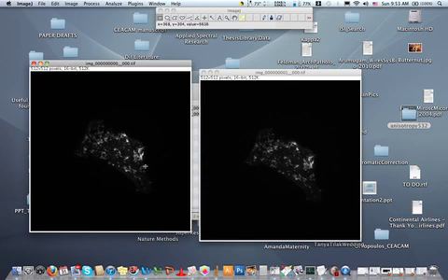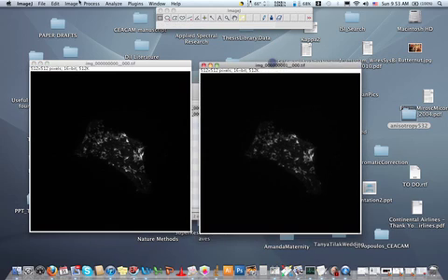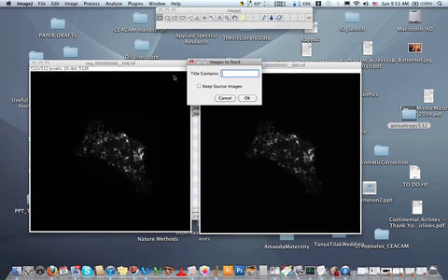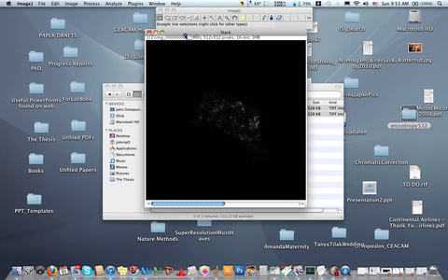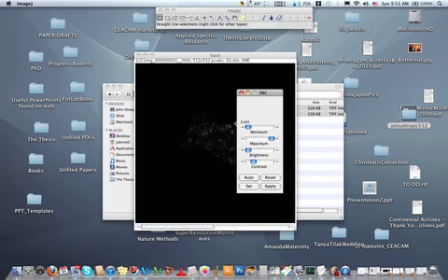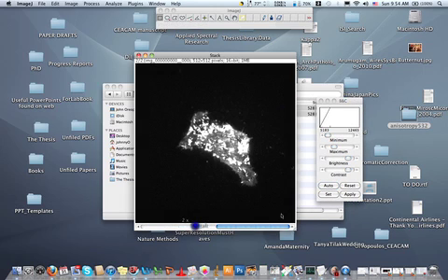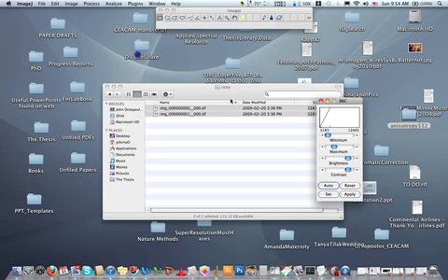This is the image collected when the polarization on the input and the output is parallel, and this is the image when the polarization input and the output are perpendicular. Now I'm just going to put those into a stack so you can actually see that there is an intensity difference here. I'm just going to auto contrast this. This is way blown up, more than normal, but you get the point. And it's actually put the images in the wrong order, but anyways, there they are. So I'm going to close those up.